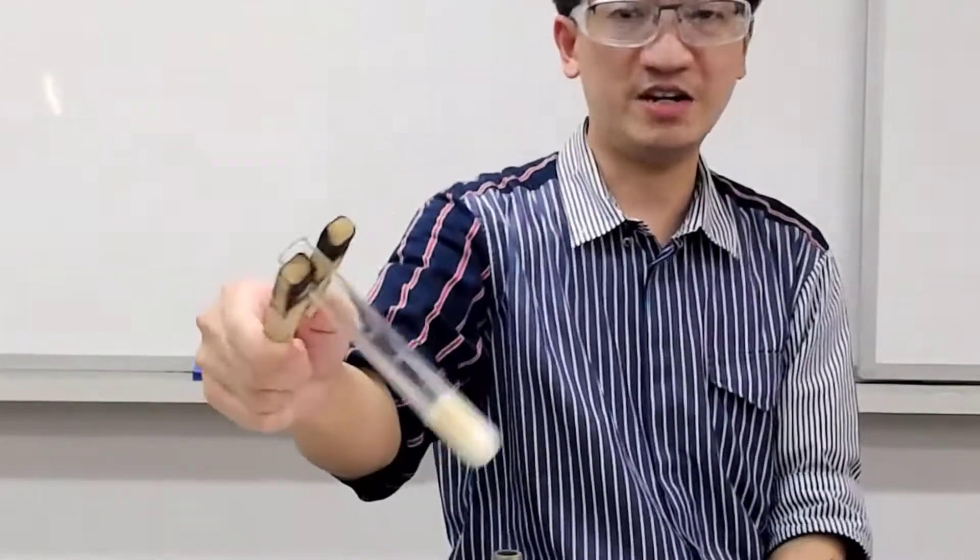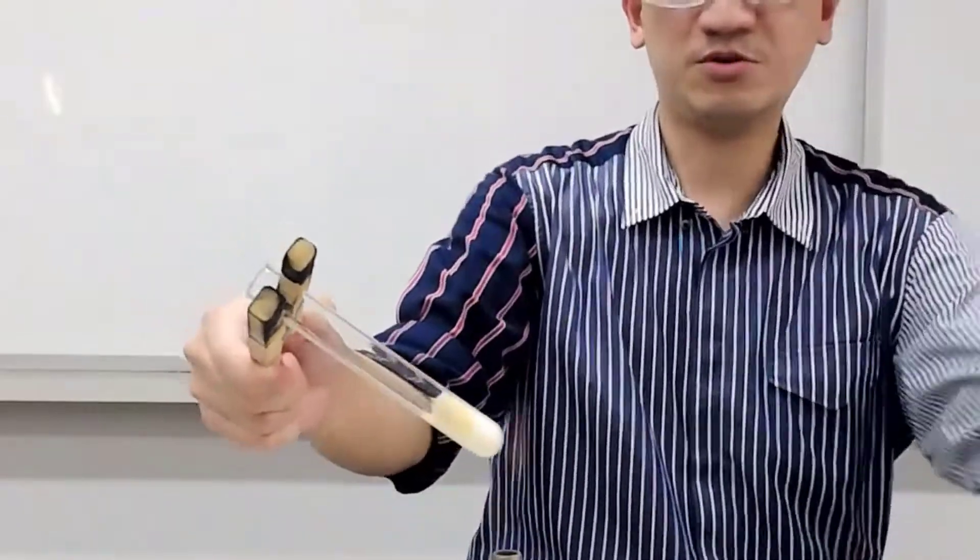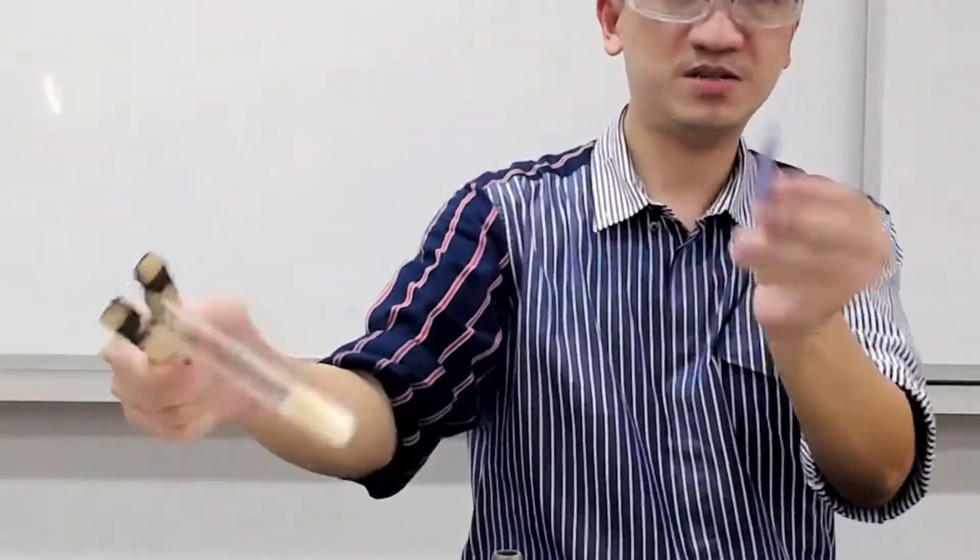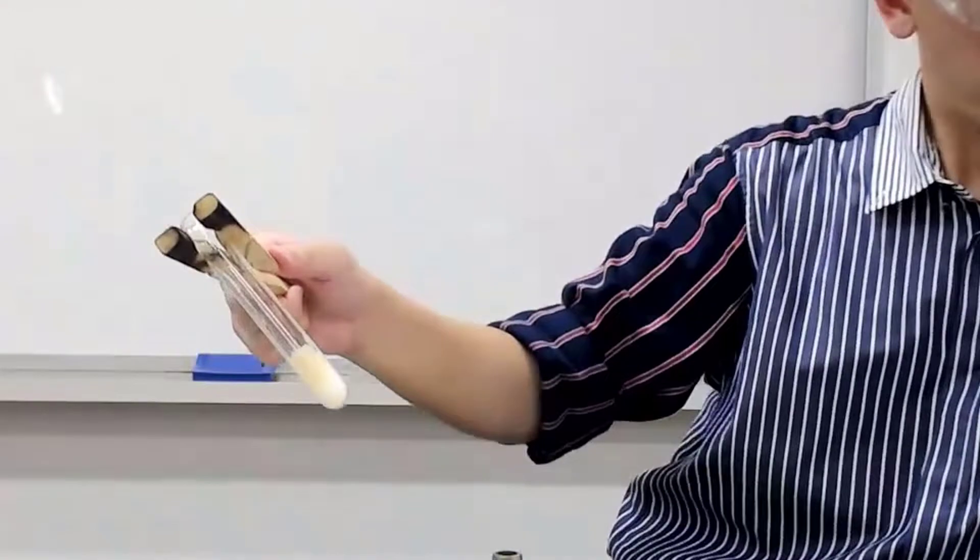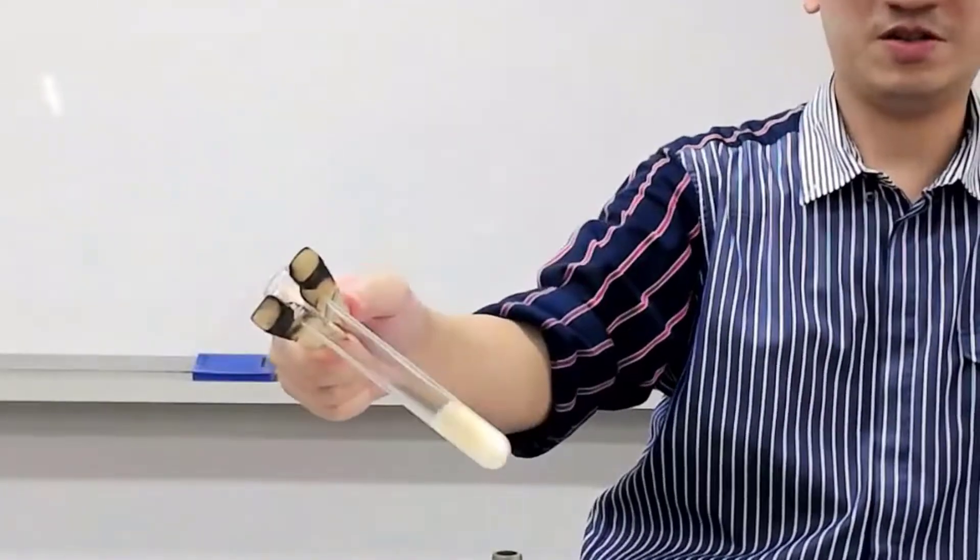Right now I'm going to test for NO2. I'm going to use a blue litmus paper. We're going to moisten it with a little bit of water for you to observe.